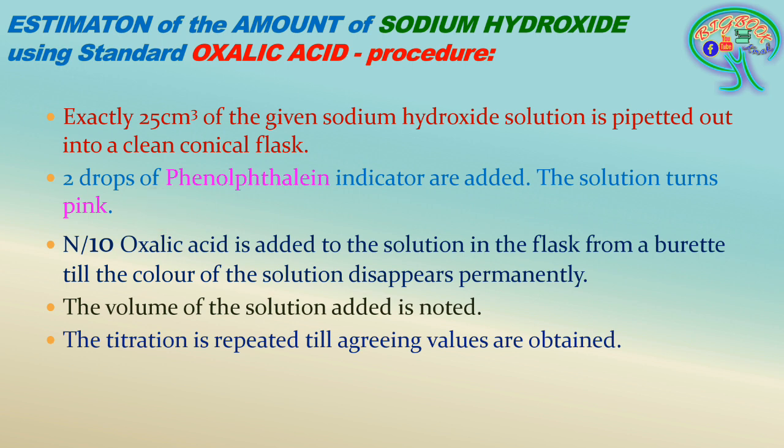Then we are going to take this conical flask of sodium hydroxide solution of known volume but not the normality, which is again with the phenolphthalein indicator, and it will be titrated with the 0.1 normality oxalic acid. So here we know both the normality and also the volume, which is going to run down now into the conical flask with the strong base of sodium hydroxide and the phenolphthalein indicator.